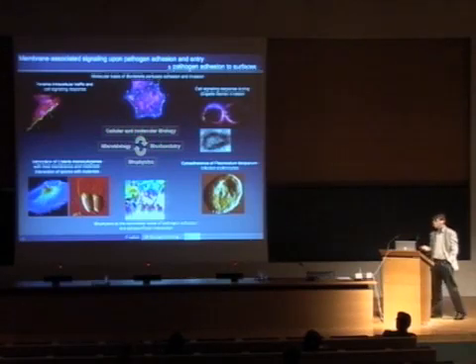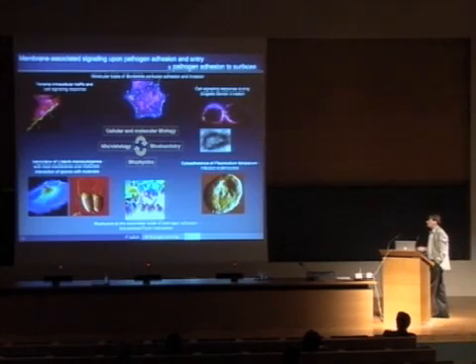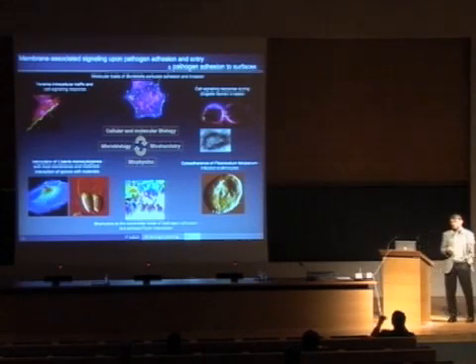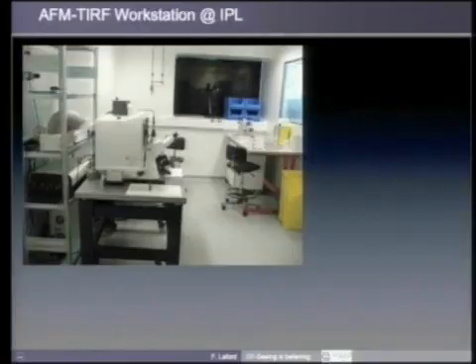And as Philippe was saying, today I will focus my presentation on giving you a flavor of what you could do using this atomic force microscopy to study host pathogen interactions. So first I will introduce the instrument. So this is the AFM that we are using to study host pathogen interactions.